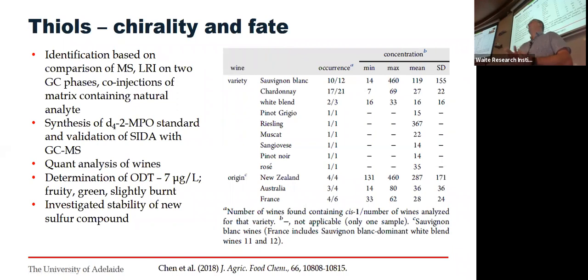So you might see a pattern here. It's like, hey, well, you need an idea first, then you either go looking for it or produce the standards, then go and identify it and go through all those steps, then develop and validate the method, then apply that method. And that's really the end game almost, is getting to the application of the method. And, you know, once we've got these methods from there on, we can apply them however we see fit.